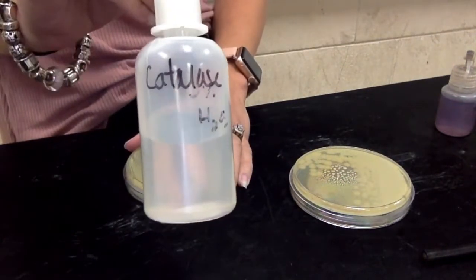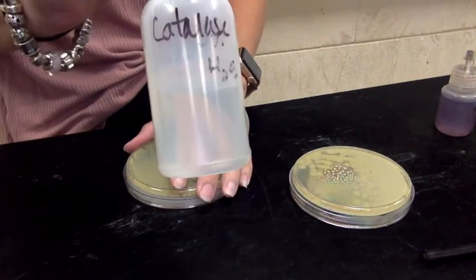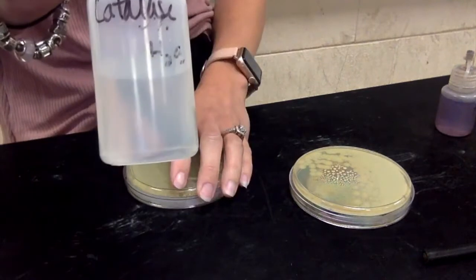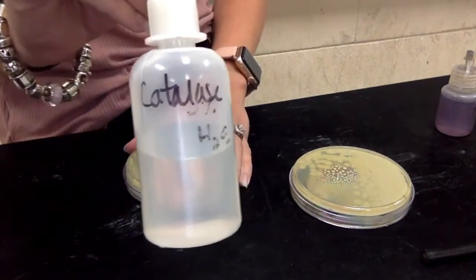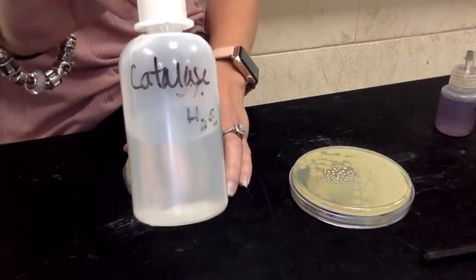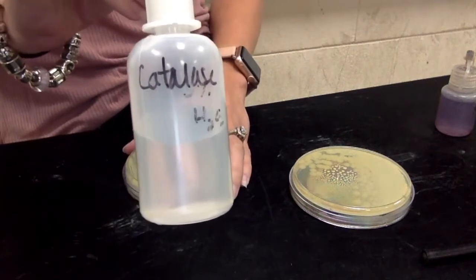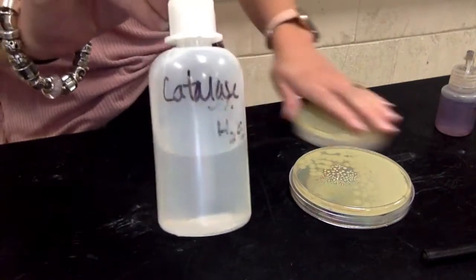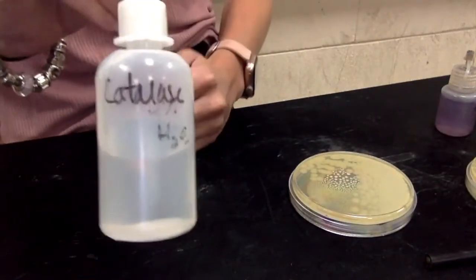They don't like it. So if they have the enzyme catalase, they're going to break this hydrogen peroxide down into water and oxygen, or bubbles. So once I add the hydrogen peroxide, if I see bubbles, then that's a positive reaction for catalase. No bubbles would be a negative reaction.